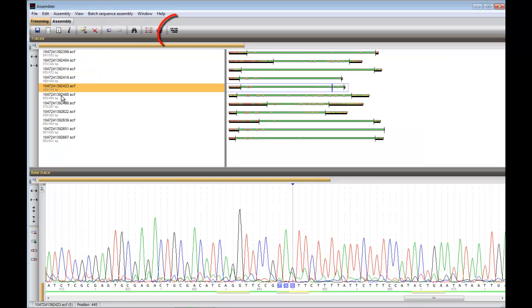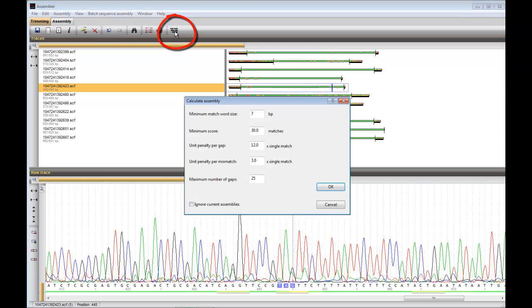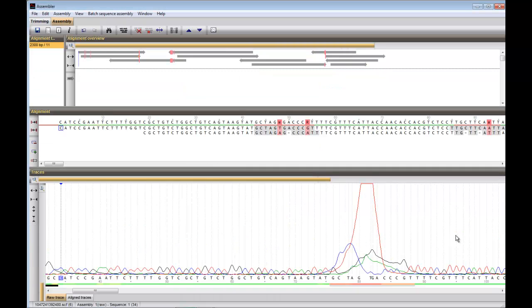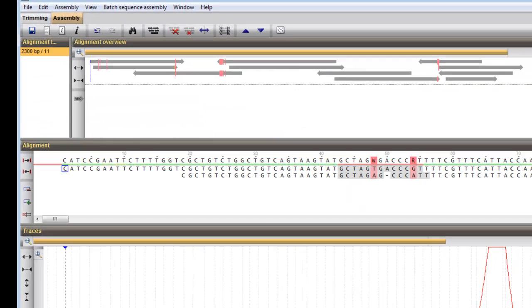Now we will move to the next step and assemble the sequences. I will do so with the default settings. The resulting assembly is shown in the Assembly tab.